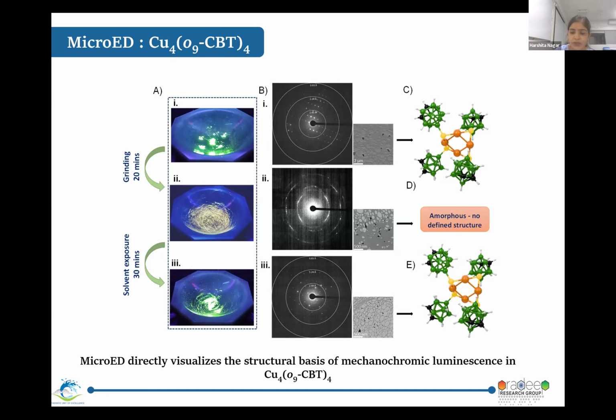I don't think so. Maybe we can try this: if the crystals are large enough, we can do micro-ED directly before grinding, then do micro-ED after grinding, and relate the studies between them. Before grinding, your crystals are much larger, so you can do that.